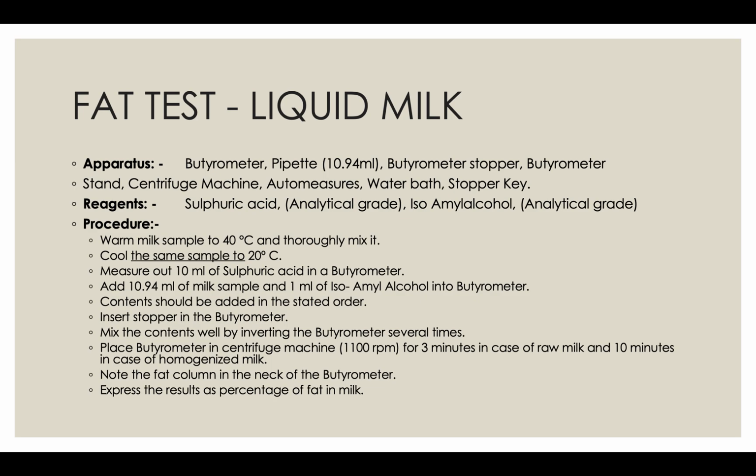To perform this test, the apparatus that is required is a butyrometer, pipette of 10.94 ml, butyrometer stopper, butyrometer stand, centrifuge machine, automeasures, water bath, and stopper key. Reagents for this test required are sulfuric acid of analytical grade and isoamyl alcohol.